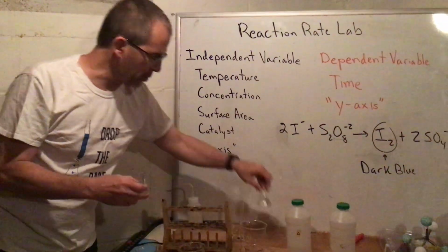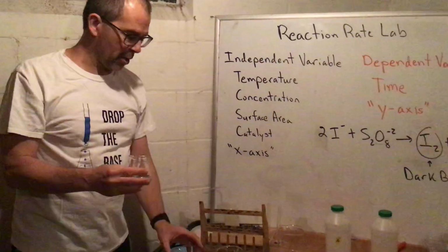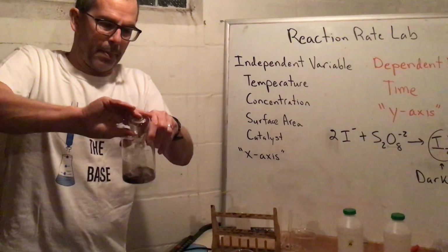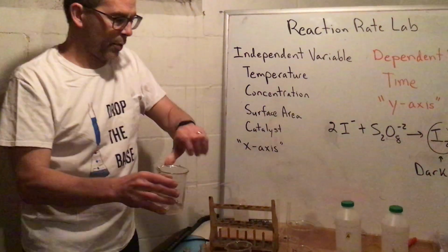Okay, so I got my two things. I'm going to dump them in here, and 3, 2, 1, go. And I'm going to swirl that around.